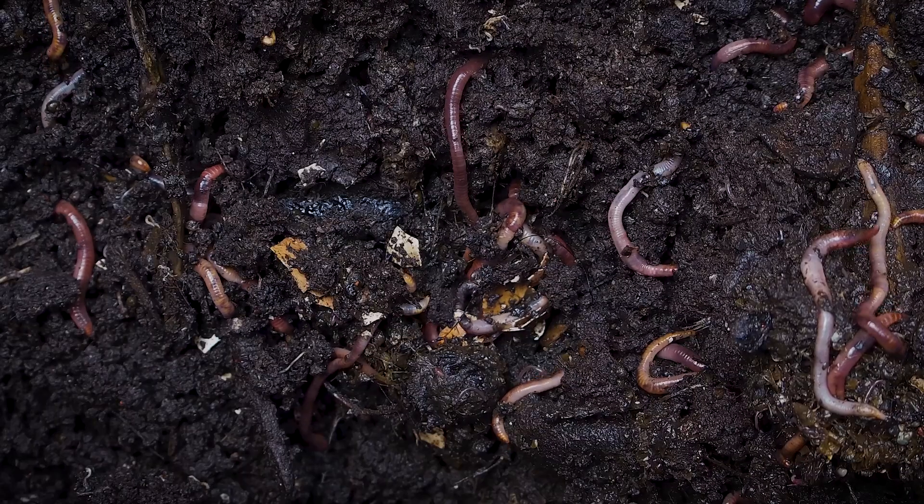This biopolymer actually attracts microbes in a landfill environment that allows it to break down. And we at EcoGloves have brought to you a revolutionary biodegradable disposable glove that works the same and is almost identical to your standard disposable glove.